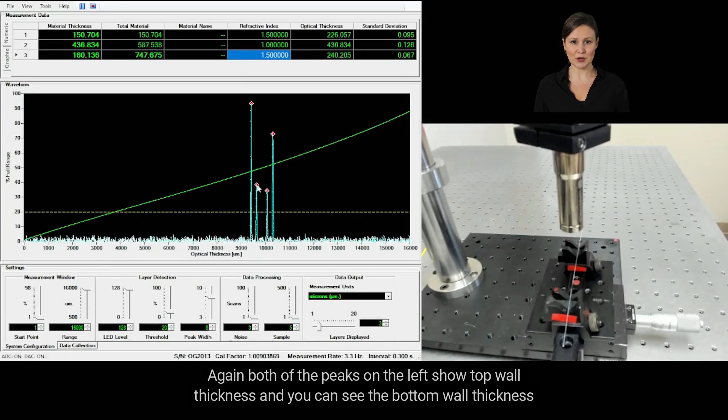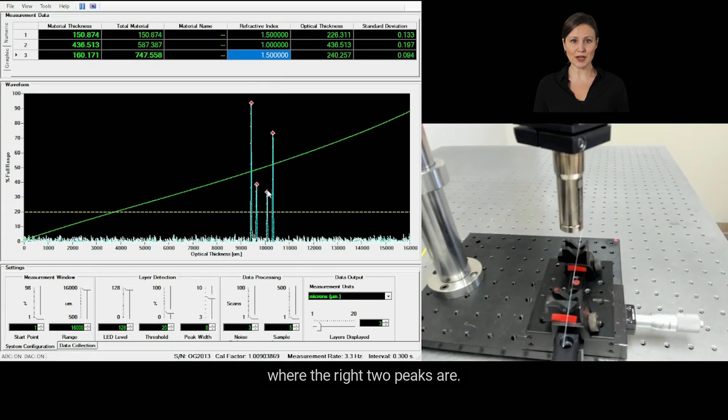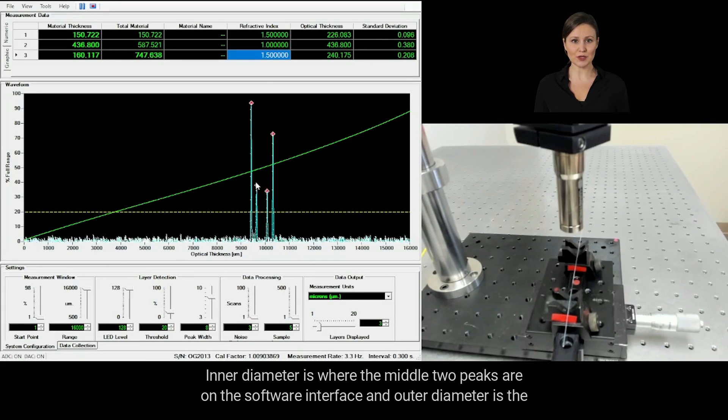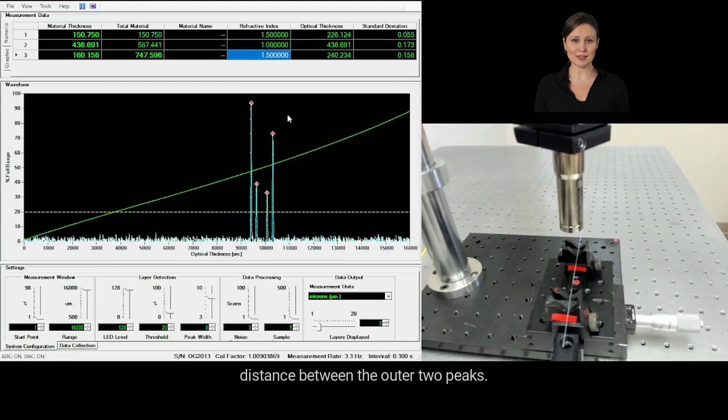Again, both of the peaks on the left show top wall thickness, and you can see the bottom wall thickness where the right two peaks are. Inner diameter is where the middle two peaks are on the software interface, and outer diameter is the distance between the outer two peaks.